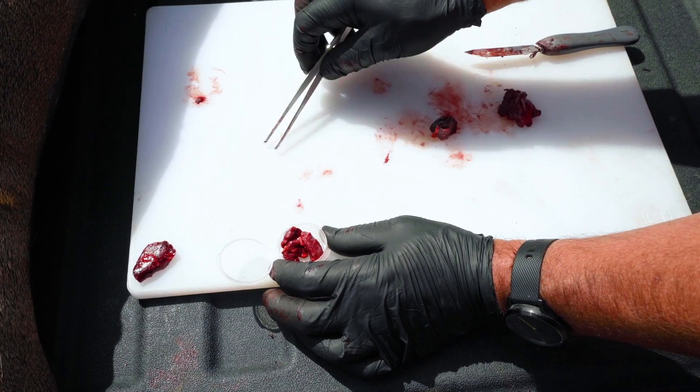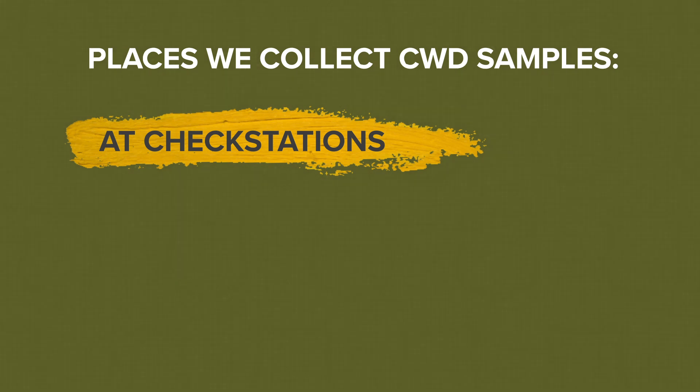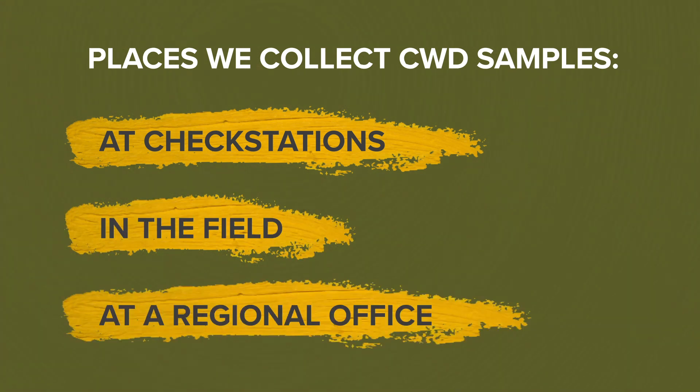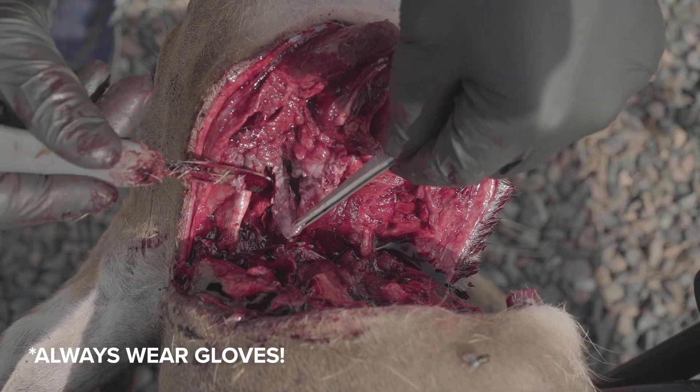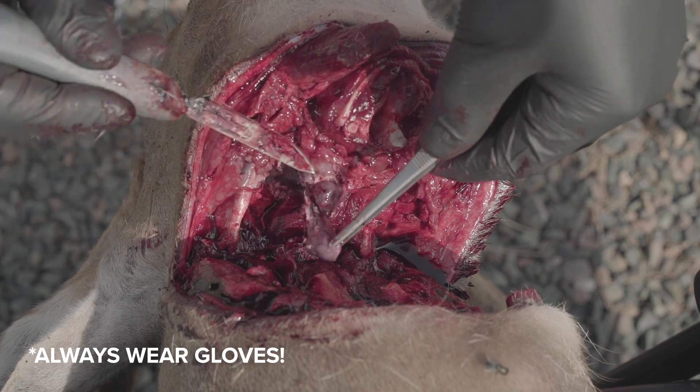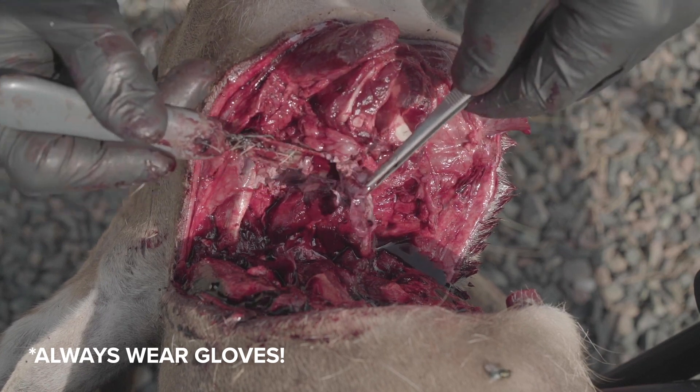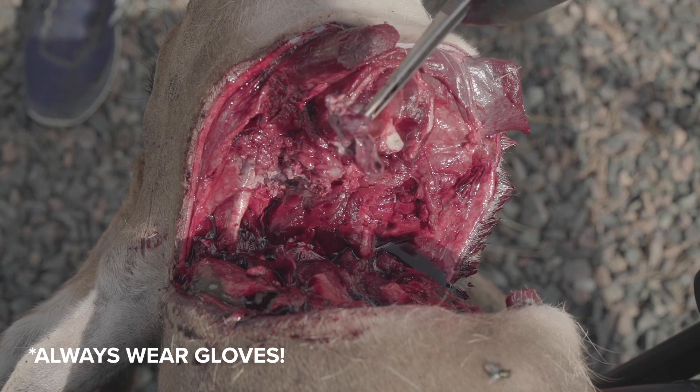The first step is to collect and submit a sample. We collect CWD samples at check stations, in the field, at our regional offices, or receive samples from hunters. The sample is collected from the head. Leave about two inches of neck attached to ensure that we can collect the lymph nodes for testing.